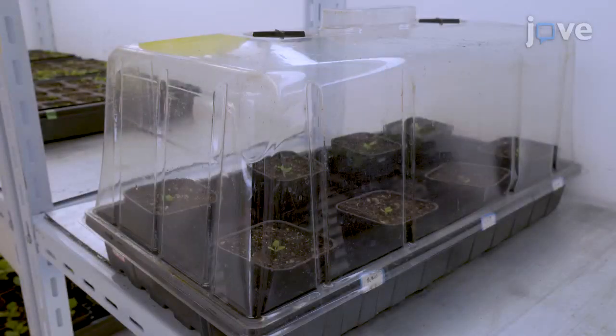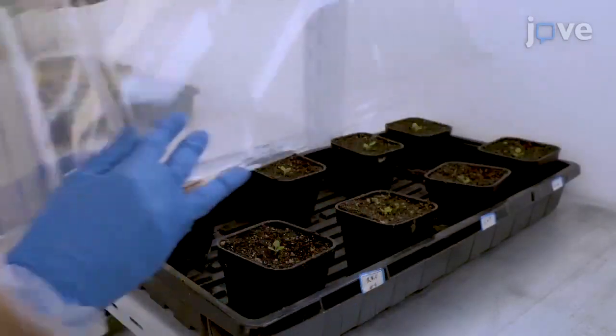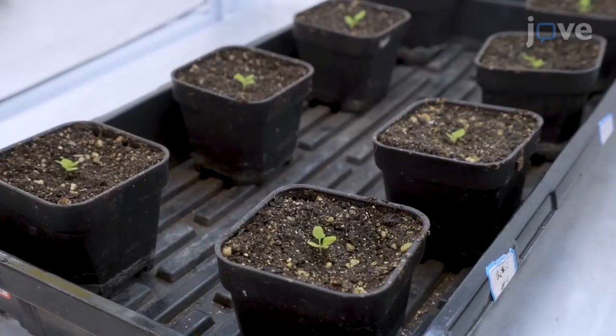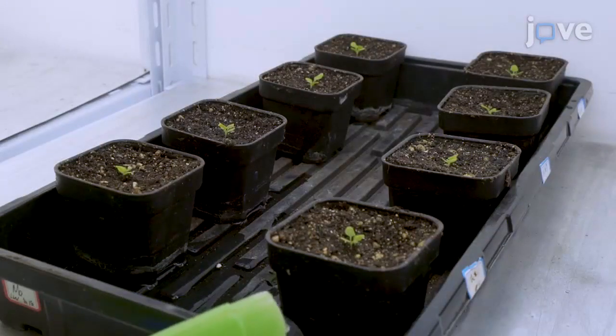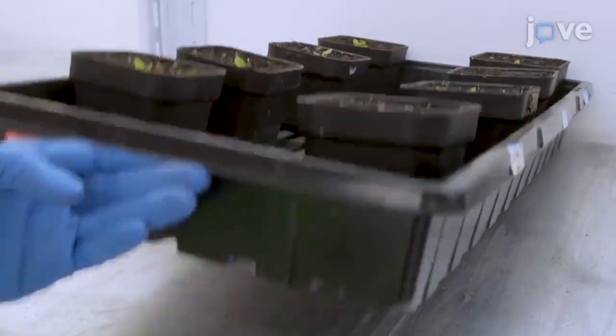After three to four days, the seeds germinate. Take the plastic dome off and allow the seedlings to grow under the same conditions used for the germination step. Every two to three days, add an appropriate amount of water, keeping the soil moist but not soaking.